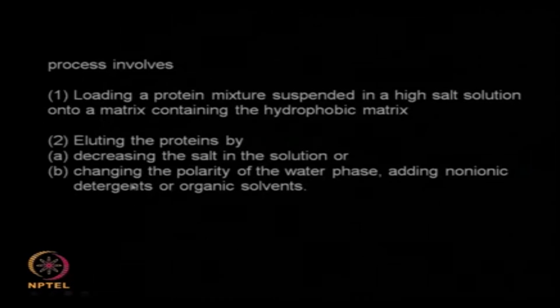Later on we will change the polarity of the phase by adding non-ionic detergents or organic solvents. During the process, whatever hydrophobic proteins that have been attached to the hydrophobic matrices will get released. So these are the various steps in the entire process of hydrophobic interaction chromatography.